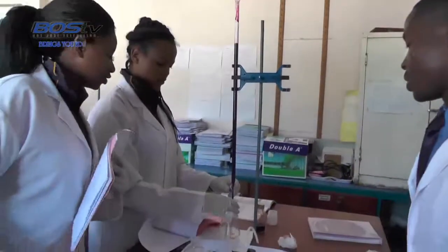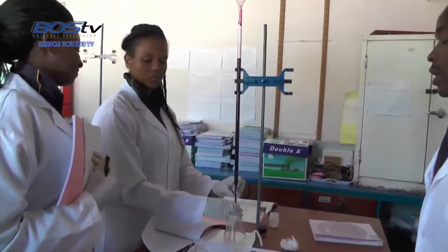We're supposed to add FA3. Before adding that, you add FA3, 20 cubic centimeters. Add FA3, 20 cubic centimeters.